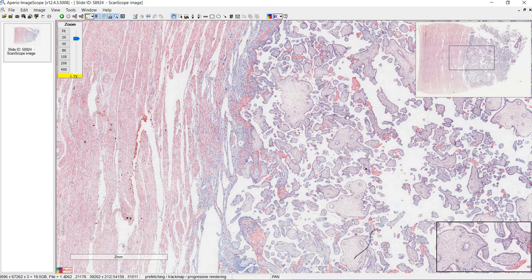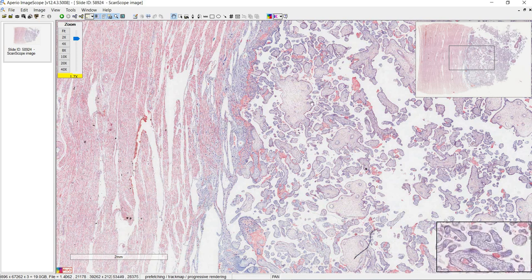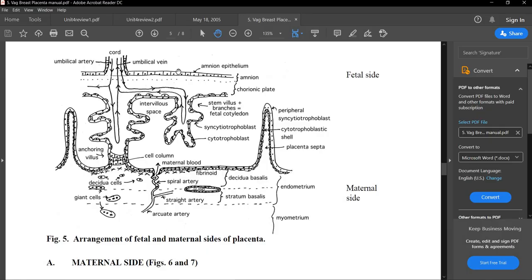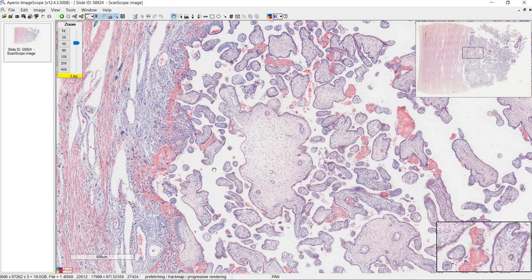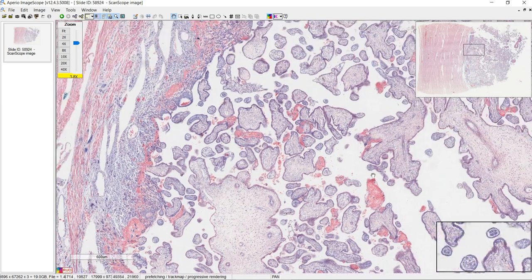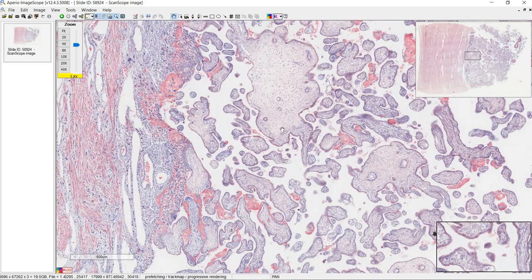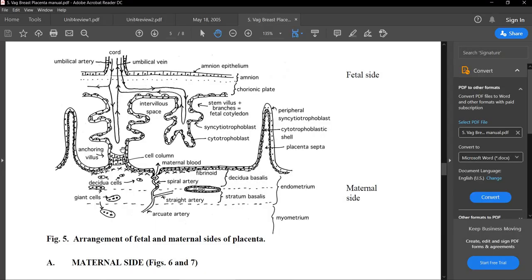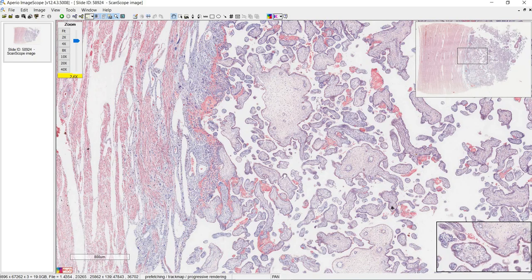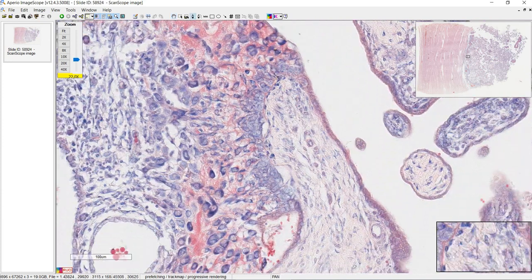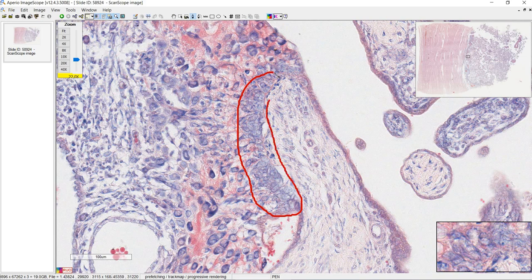Going back to the microscopy slide, all of these little islands of tissue are either a stem villus or one of its branches — the larger ones are probably the stem villi, and the smaller pieces will be the branches. All of this white space is intervillus space, where the maternal blood will be. The interface between the trophoblast and the intervillus space is where nutrient and gas exchange will occur. Here's the anchoring villus, and this is the cell column made up of those peripheral trophoblast cells.